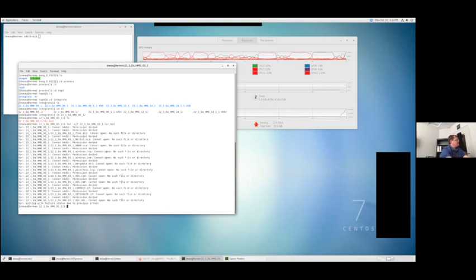Oh, it's because I don't have permission, but you can see what that contains. What it would do is expand out these files, and these are files that are generated by Rapid during processing.